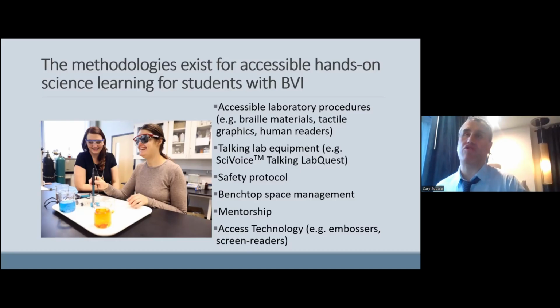Be oriented to where the location of a safety shower is, emergency exits, how to use an eye wash, and those sorts of things, because you never know when an emergency might happen and who's responsible for who. I mean, it's easy to delegate that responsibility to a sighted buddy, but in the end, it's most important that everyone be able to take care of themselves if the unthinkable should happen.